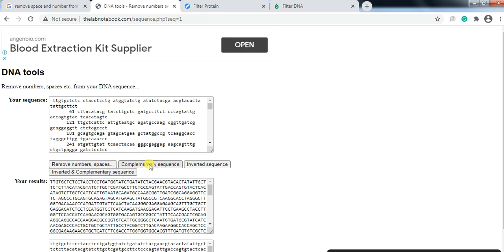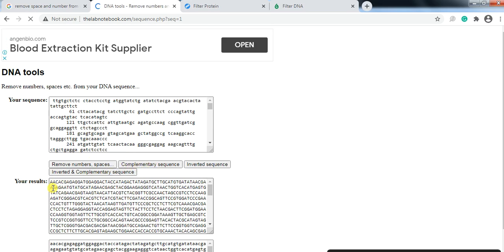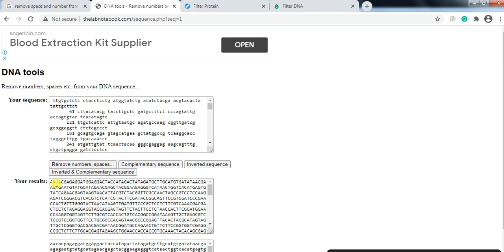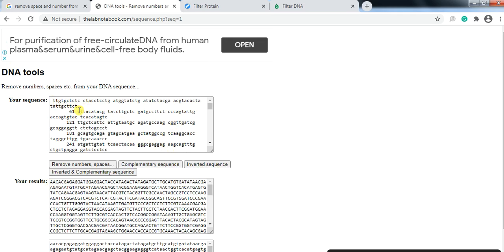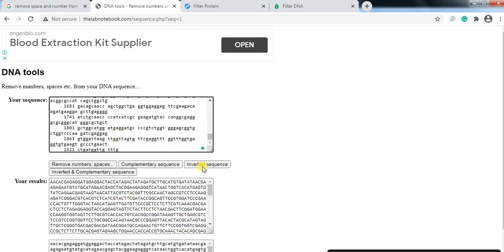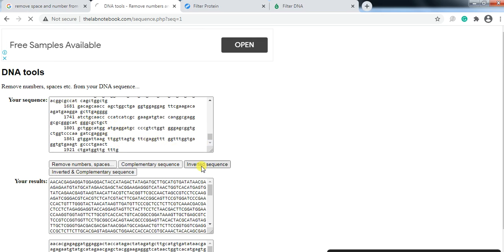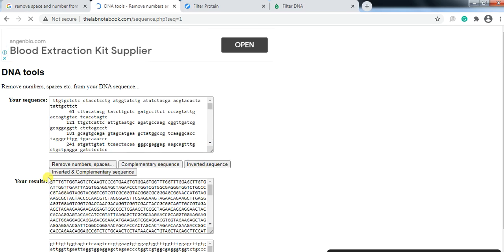If you need the complementary sequence of this, click on complementary so you will get the complementary of that sequence. Here if you want the inverted, means that the 3 prime end went to the 3 prime end and the 5 prime end inverted. Now you have got the inverted sequence of that.